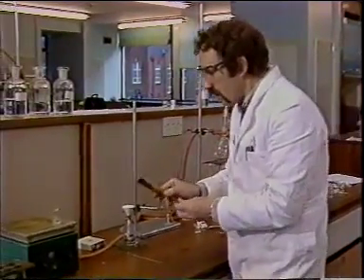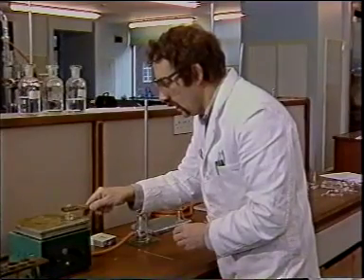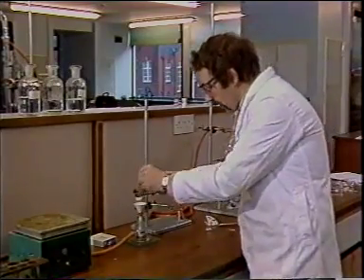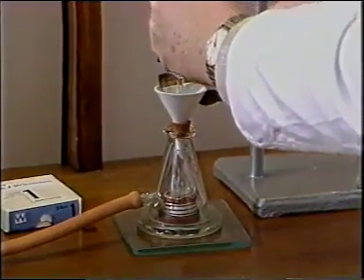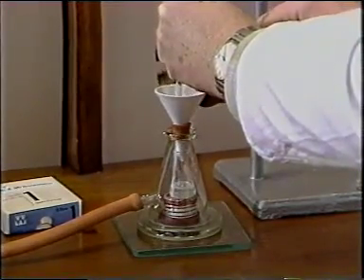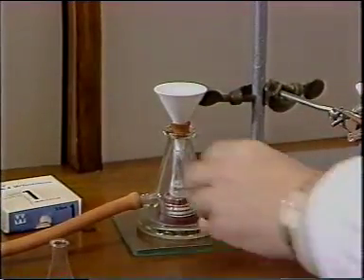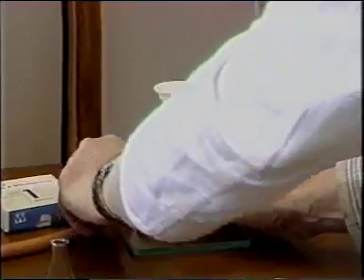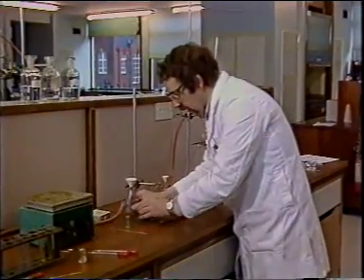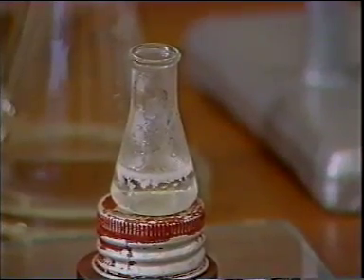Alternatively, our hot solution can be filtered under suction in this Buchner apparatus with a loose bottom. And the solution allowed to crystallize in this small flask.